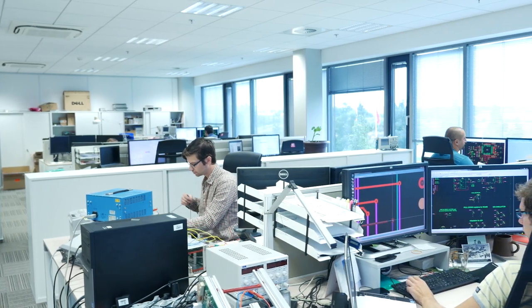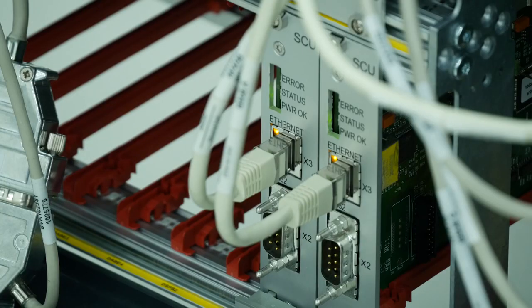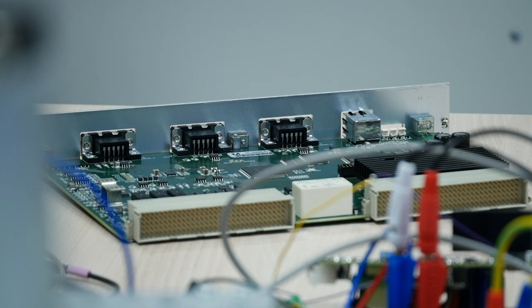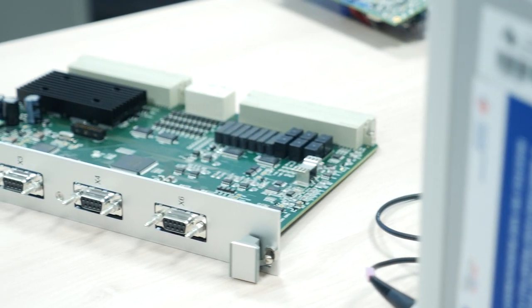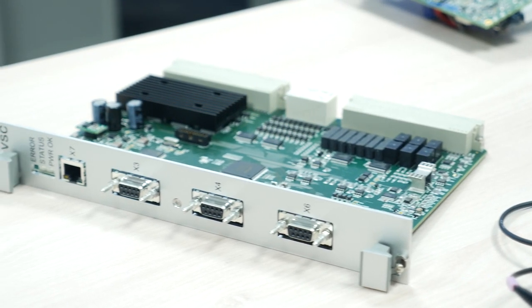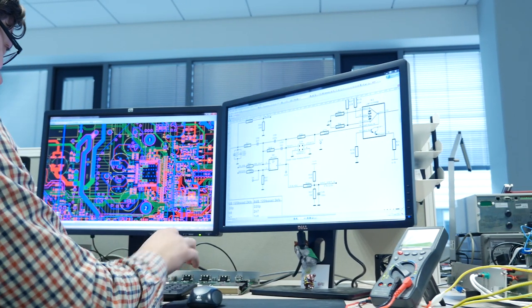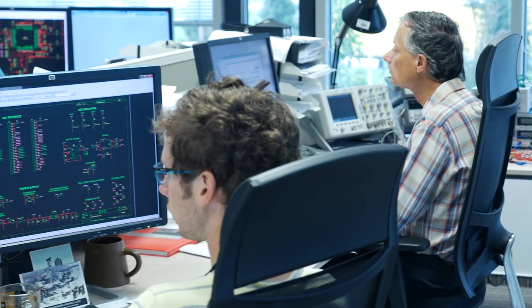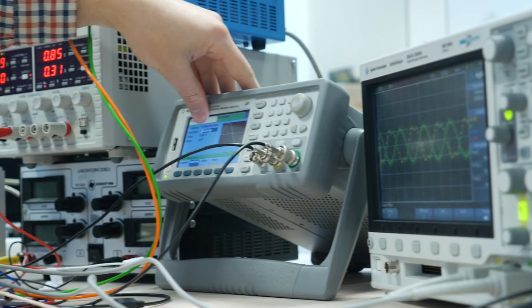Every electron microscope needs several dozen electronic boards for it to properly work. Wait a minute, let me guess. Very precise voltage will be needed again. So these are not just common boards. You are right, as usual. A very precise voltage source is needed for the electron beam. Very precise current and voltage sources are necessary for electron beam deflection and shaping. And special low noise amplifiers of very low currents are needed to amplify signals created by backscattered or secondary electrons.